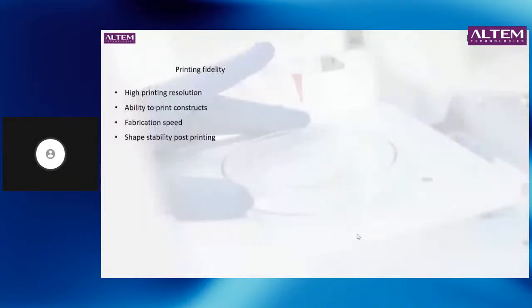The requirements, being printing fidelity, the first point. Here you require high printing resolution when you are trying to print any structure. There should be an ability to give you a good construct while you're printing. There should be good fabrication speed, shape stability, and post printing processes. So if I have to print a structure of specific fidelity, you also need stability within the structure, so that once you remove it from the site of printing, it stays in its actual form. So that becomes an important point about shape fidelity.